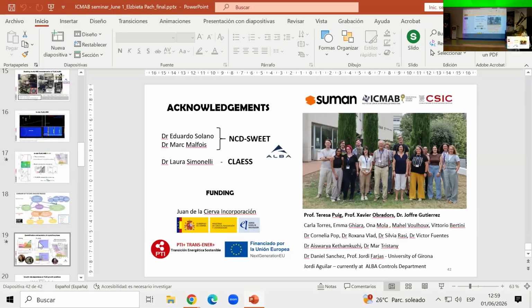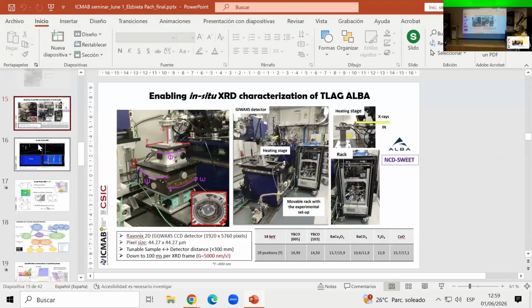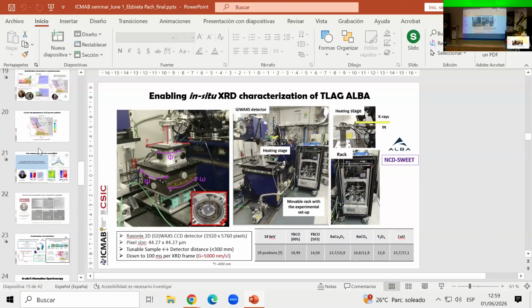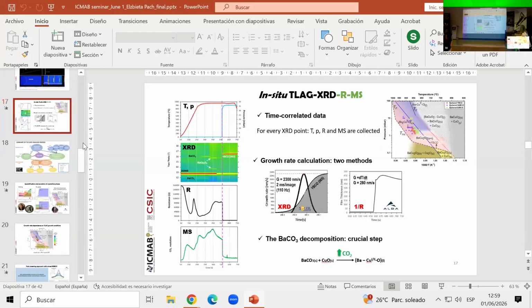It will be easier to explain maybe here. I don't see it, where is it? Oh, here. So you have the conductance, the inverse of the resistance curve. So this is around the jump moment.